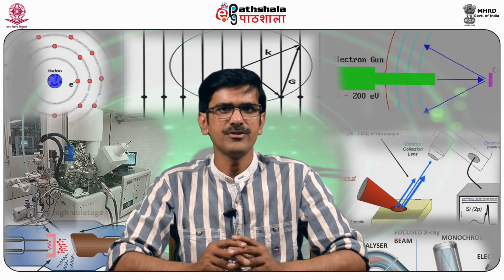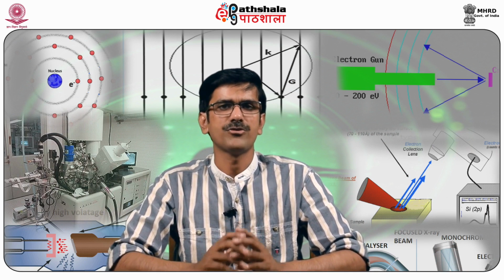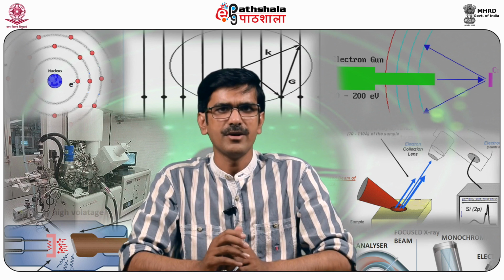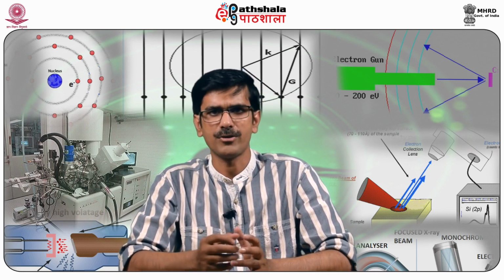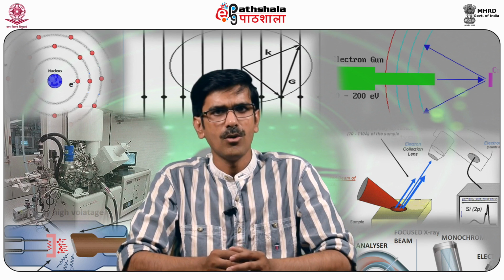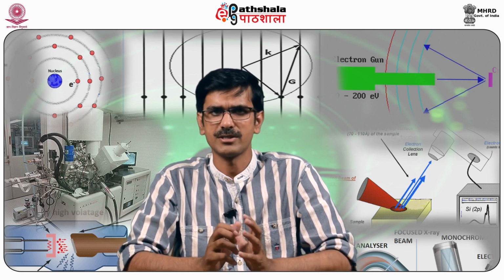EDX is a qualitative and quantitative X-ray analytical technique that provides information on the chemical composition of a sample. It involves the generation of an X-ray spectrum from the integrated scan area of the SEM, scanning electron microscope, or the micrograph. There are certain energy constraints which are used in this analysis. Now, what is an energy constraint? It means something that controls you by keeping you within particular limits.